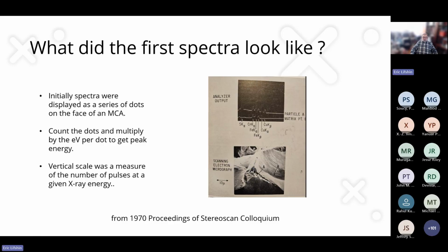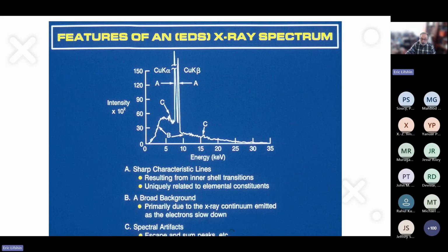When I look back, I think about how funny some of this is. I had to count those dots and pray that the phone didn't ring or somebody interrupt me and I lost count. And a great technological innovation was when someone came up with the idea of intensifying every 10th dot, so you could get up to the peak and do them 10 at a time. The vertical deflection there refers to the intensity.